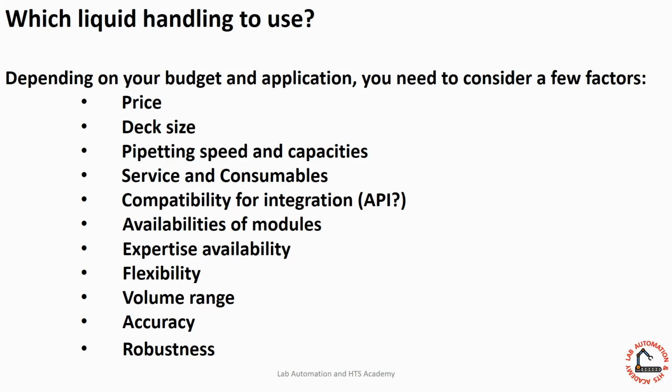And actually my first job was like that. I had to reprogram the robot for a different assay every month or every 2 months. So then flexibility is important. And I'll get to this point when we talk about the Hamilton and Tecan in the future. But that is also something important. Are you working in a testing lab, doing routine testing? Or do you want to quickly redesign and reprogram your robot to do different assays?